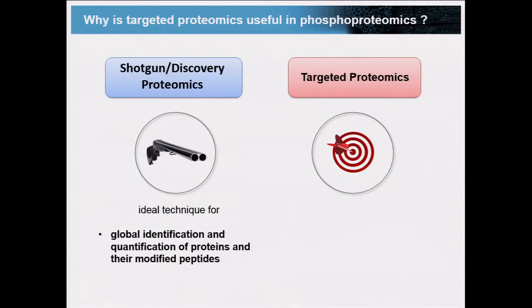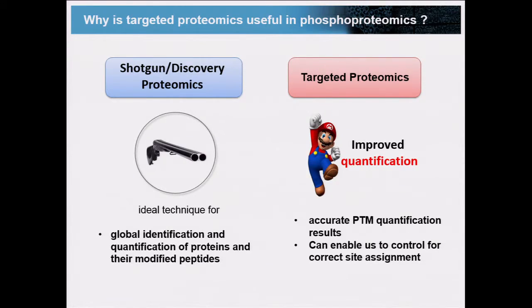And that's where targeted proteomics comes in. In targeted proteomics, we can try and account for these differences and try to very accurately do PTM quantification and to control for the correct site assignment.